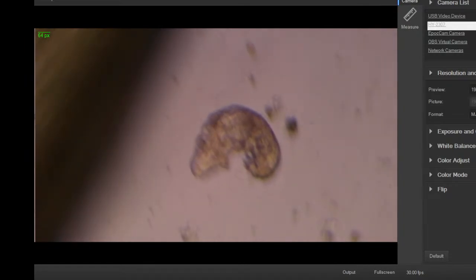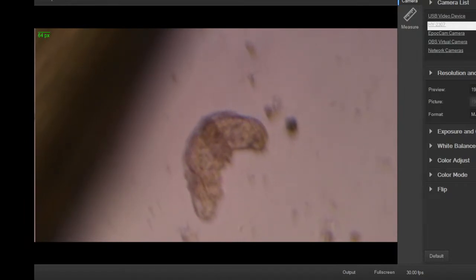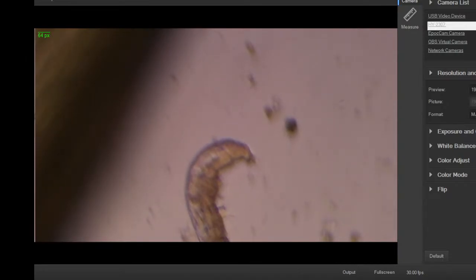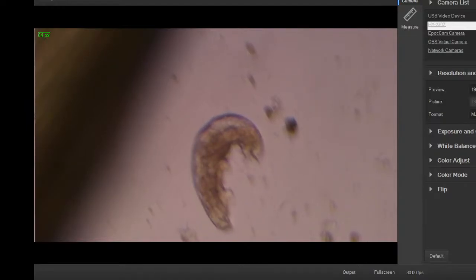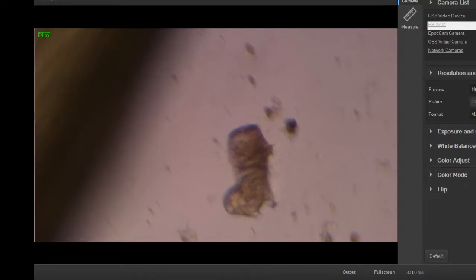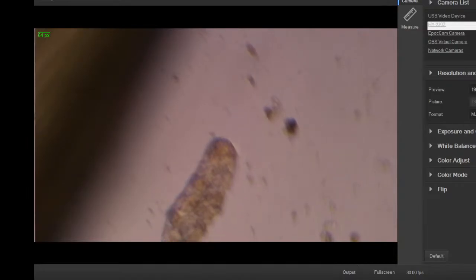In an earlier video I had tardigrades under the dissecting scope. This one's got some color to it because it's been eating a lot of different color items. But they often have just kind of an opaque, semi-translucent look to them in normal lighting, not this transmission lighting. And you can see them just barely with the naked eye, as tiny, tiny little dots in the water, if you know exactly where to look. But it's difficult. They're very, very small.